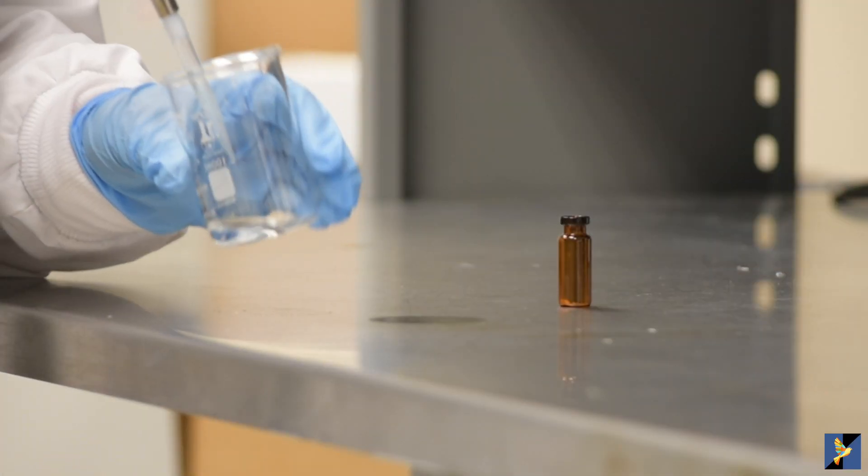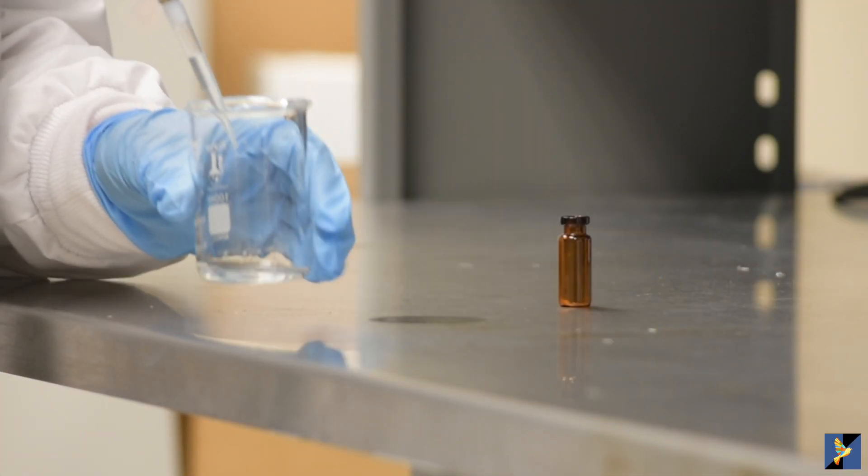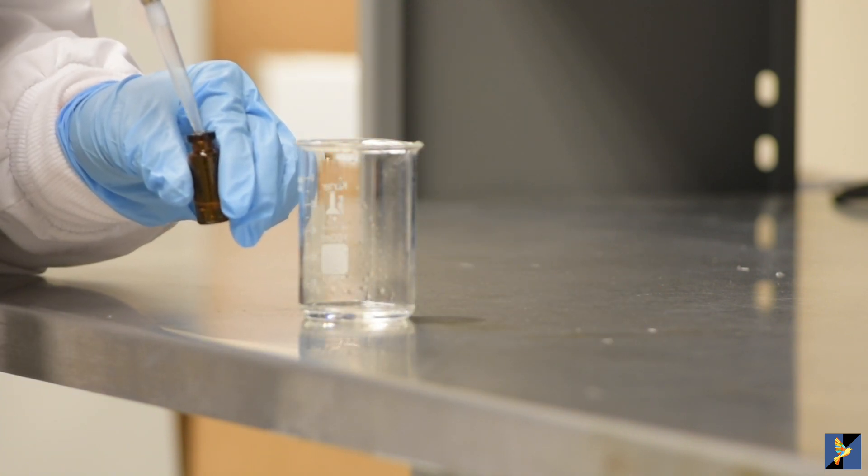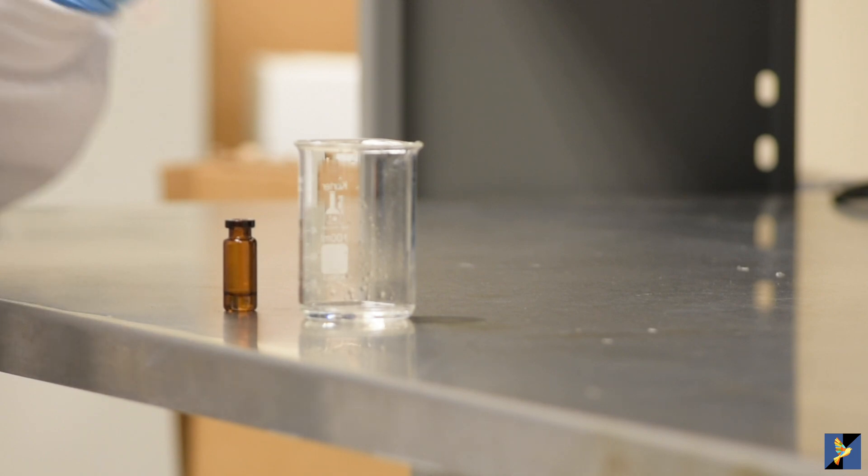Begin by reconstituting one vial of the Proteometer L reagent by adding dimethyl sulfoxide. Gently mix the contents and set in the dark for at least 30 minutes.